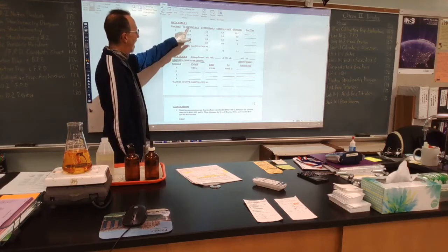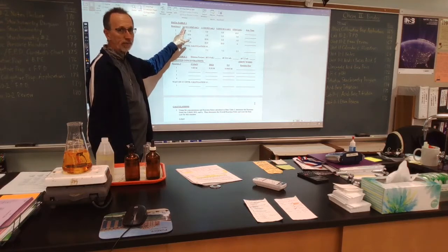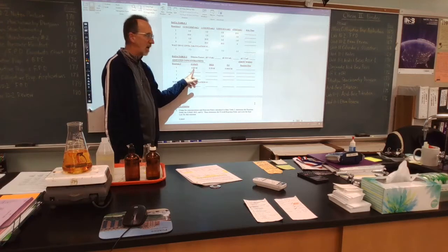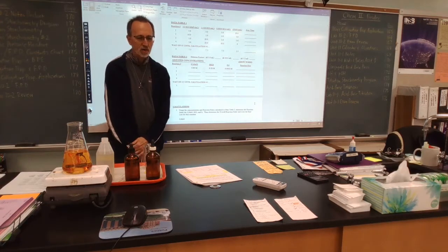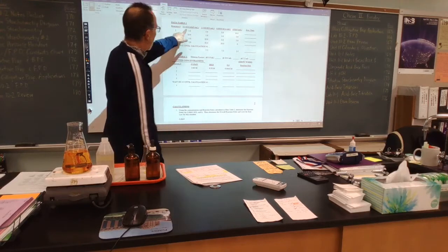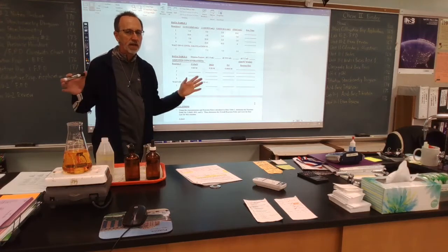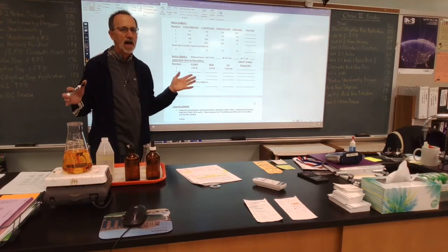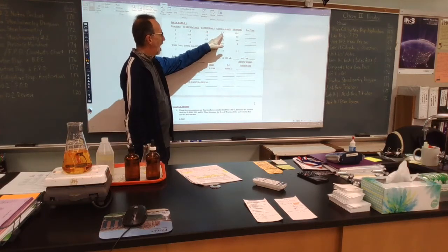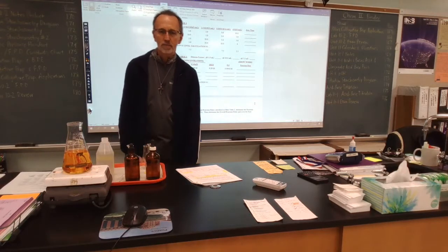So our acetone out of the bottle here is 4.0 molar. Down here, the adjusted concentration is different. I want you to see why that is true. So we go back up here. Our acetone, that's all there is in there, so its concentration is 4 molar. And you add 5 mLs of HCl and 5 mLs of iodine and 10 mLs of water.